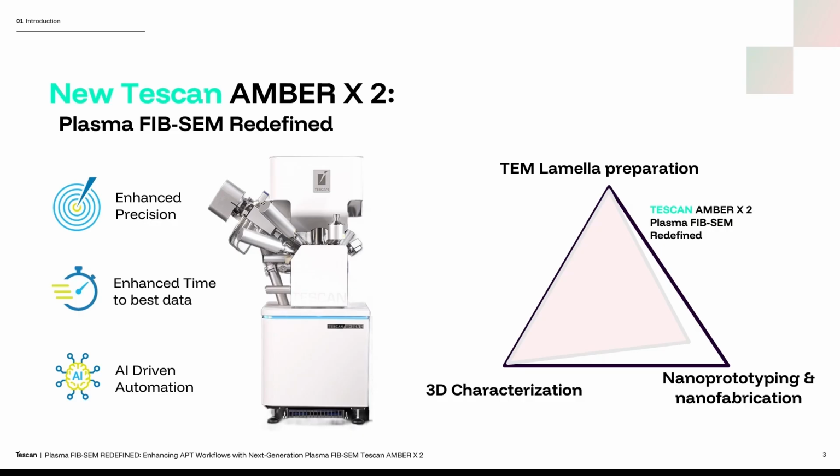But that same gallium beam can cause contamination and material interaction issues, especially with sensitive samples, making it less ideal for certain workflows. On the other side, plasma FIB-SEM systems, especially xenon-based, have been the clear choice for high-throughput applications like large volume 2D and 3D characterization. Their speed and efficiency make them indispensable when time and scale matter.